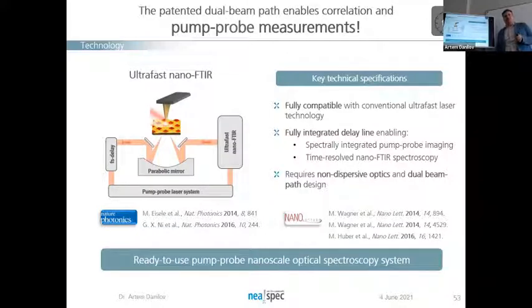All right. Regarding the detected signal, to what extent do you detect the normal electric field or the in-plane electric field, or do you detect something more complicated? Yes, if you have an analyzer, if you just detect the bright light, then you basically separate. Yeah, for people, it's okay for me regarding the in-plane.